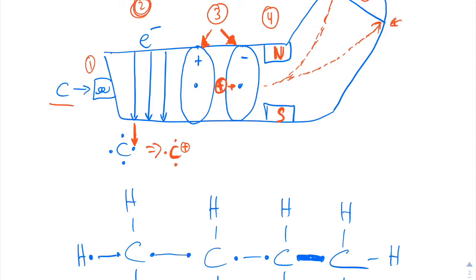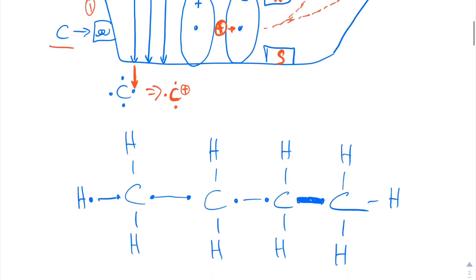Step 2, when you create the ion, when you're working with an organic molecule, it starts out as neutral, and that waterfall of electrons has some options. It can strike electrons located throughout my molecule here. It can hit anywhere. And when you picture these bonds, you basically have electrons that are here and here in the bond. You have them here and here in the bond. And basically what's going to happen is it's going to come in and it might hit right there.